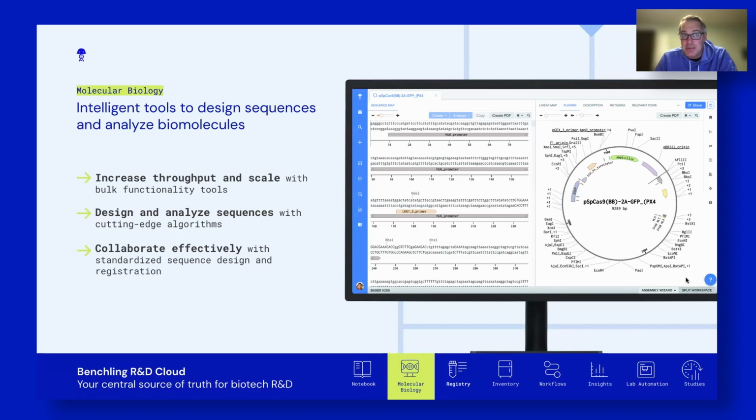As you heard in Zach's presentation, we're excited about the new RNA capabilities available in molecular biology. You can also perform sequence confirmation in bulk. You can set up DNA alignments in batches to increase throughput and minimize repetitive and tedious activities. We've expanded the tools for searching, designing, and aligning sequences. Access AlphaFold Beta to leverage the latest AI algorithms to predict 3D structures of novel proteins.